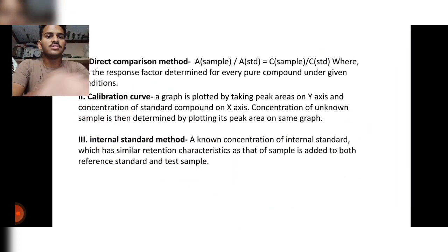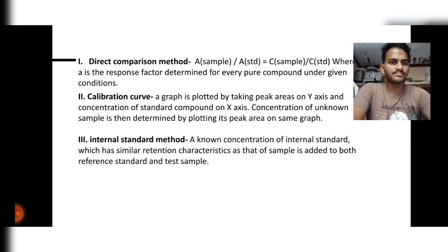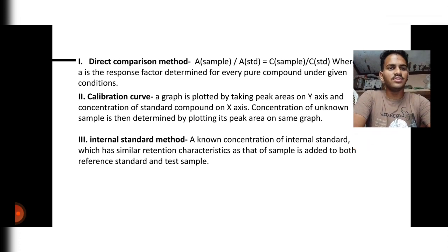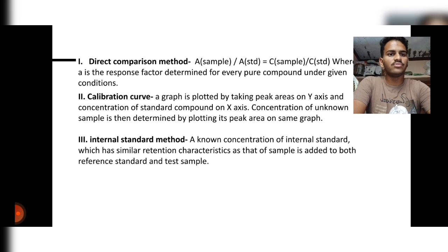direct comparison method. Direct comparison method: a response factor is determined for every pure compound using given conditions.